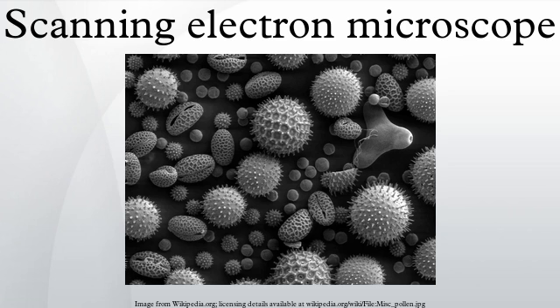Cathodoluminescence, the emission of light when atoms excited by high-energy electrons return to their ground state, is analogous to UV-induced fluorescence, and some materials such as zinc sulfide and some fluorescent dyes exhibit both phenomena. Over the last decades, cathodoluminescence was most commonly experienced as the light emission from the inner surface of the cathode ray tube in television sets and computer CRT monitors.